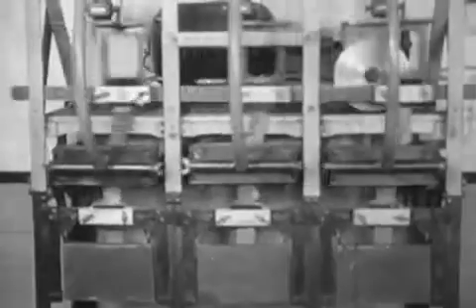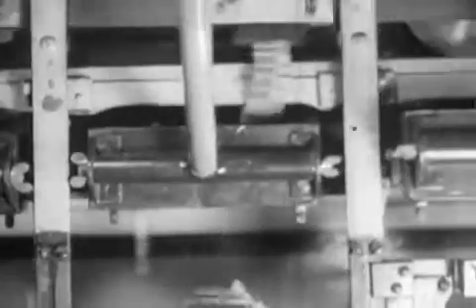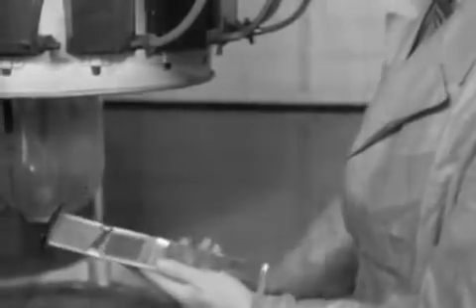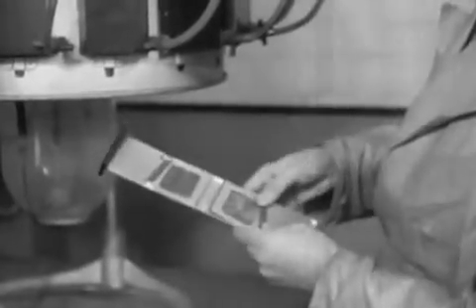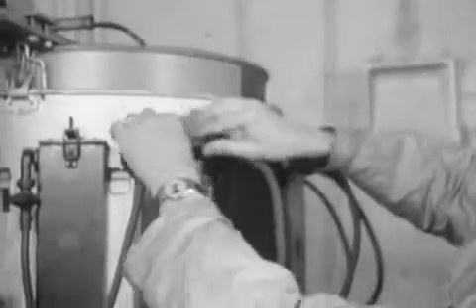Materials used for covering carriage seats, for instance, are subjected to very hard usage. This machine reproduces the wearing conditions, and seat material can be compared in this way with standard samples for wearing qualities. Strong sunlight, which may fade material, can be artificially reproduced for testing purposes in this fugitometer. Samples are exposed for 100 hours to the glare of the arc lamp, equivalent to many months of strong sunlight.